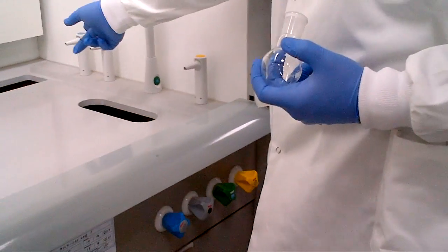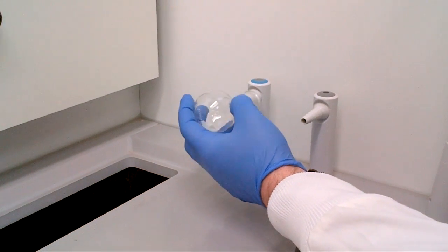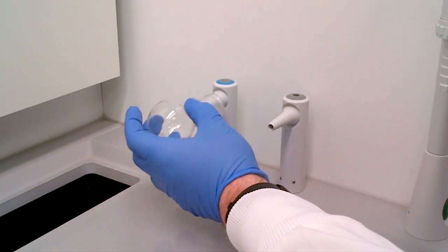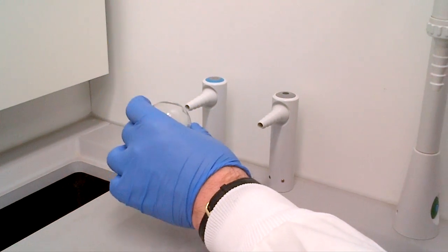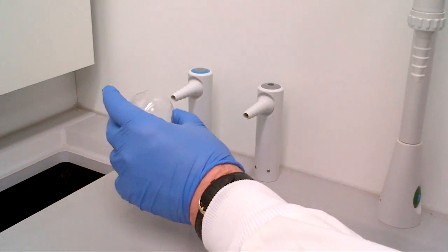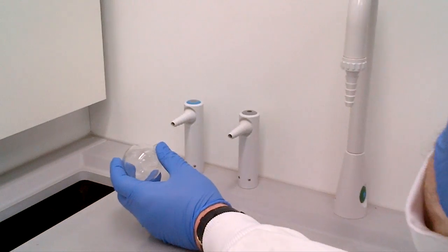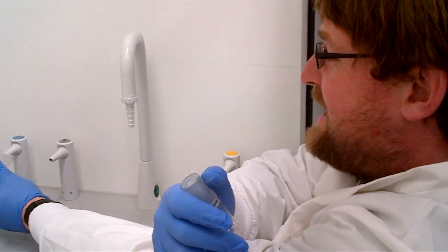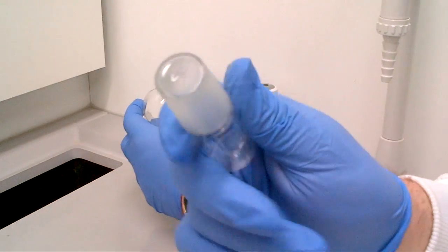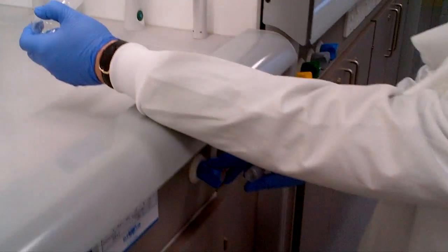going through the tap, and just place the flask as appropriate, rotate around, empty, rotate around, empty, rotate around. This would only take about maybe a minute of time. It doesn't take too long. It's a bit like with nail varnish on, when you blow your nail varnish off, ladies, or you do, gents. So you need about a minute's worth of time. By that time your stopper is dry. So we're quite happy. Once you've done, turn the tap off.